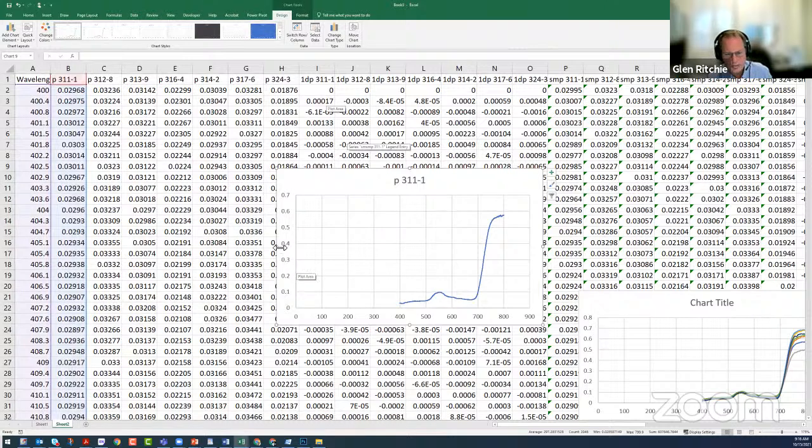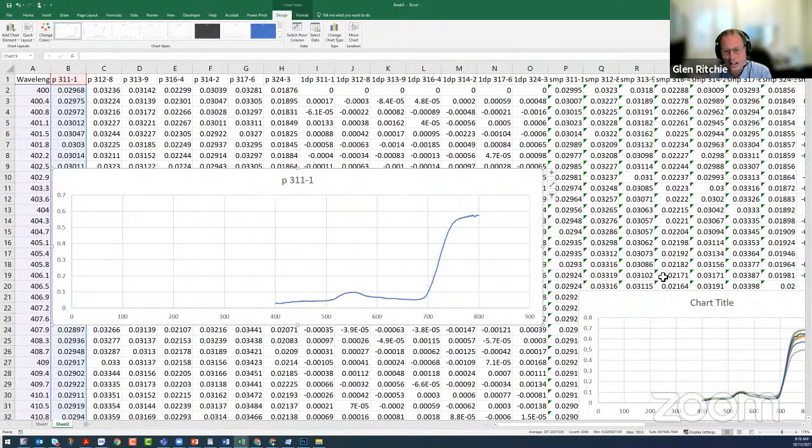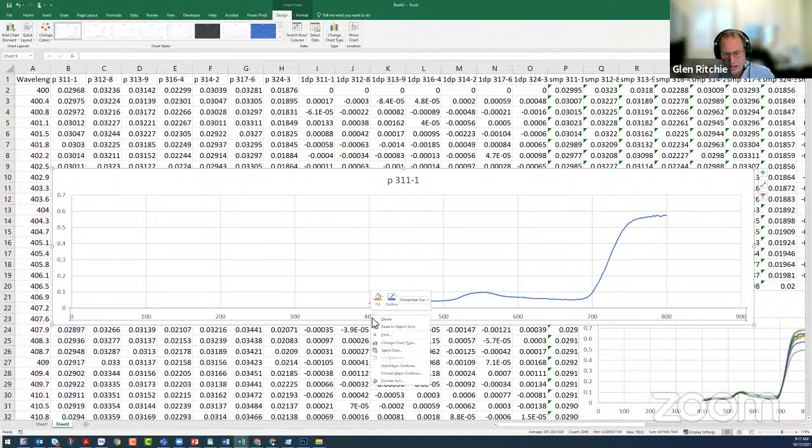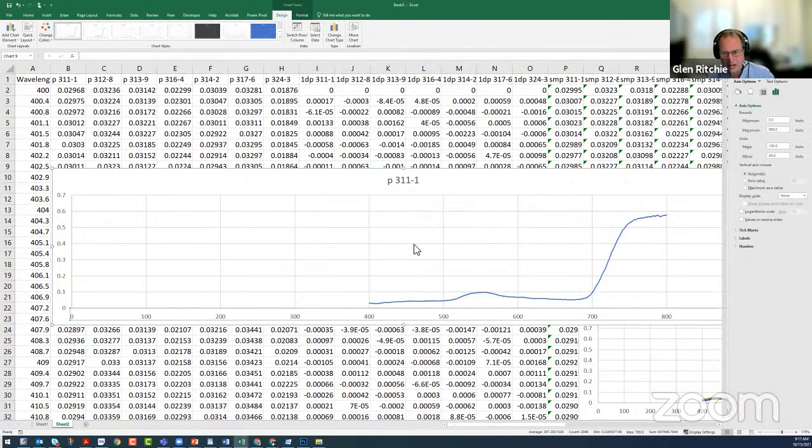When you take this measurement, you're going to take a reference measurement using a reflectance standard that's nearly 100% reflectance across the spectrum. And then you're going to point the same sensor at your plant and take another measurement. And then you're going to ratio those two things together. What you don't see is that you always have some level of high frequency noise going on. That's just there because the sensor is always going to have some level of noise associated with it.